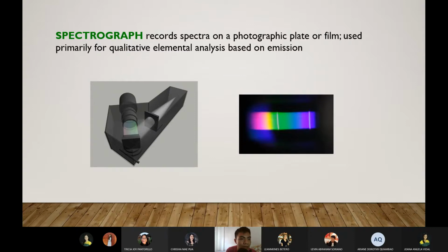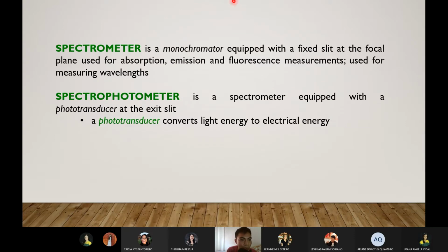Okay, another term would be the spectrometer. Okay, so spectrometer, so ano yan? That is a metering device used to measure light. So parang similar yung mga terms nila. Yes. Kaya sometimes we interchange them na lang, kasi similar naman sila ng concept lahat eh. Okay, so kapag spectrometer, this is a device used to measure the interaction of light. Para siyang photometer din.